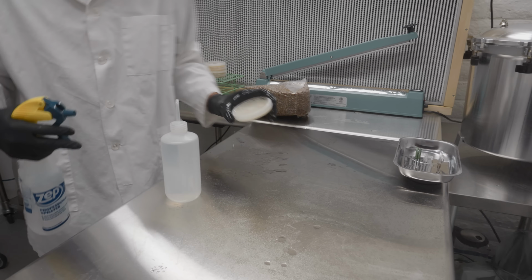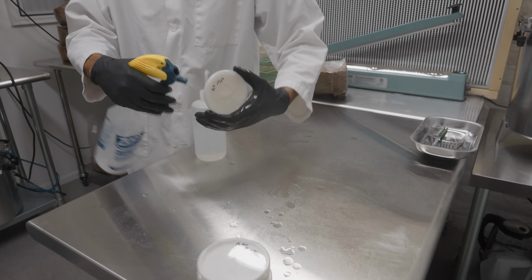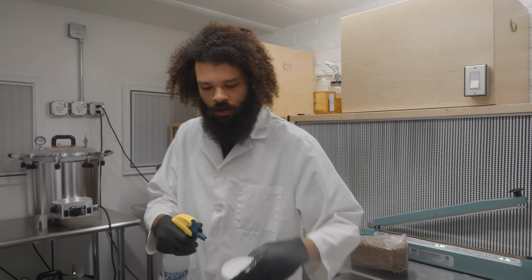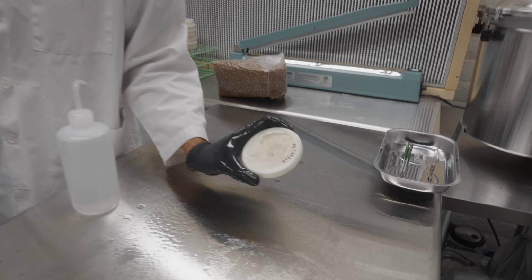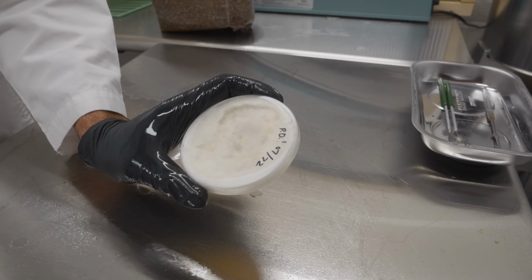So you'll notice different kinds of mycelium depending on what the species or strain is. Like the pink oyster, for instance, will develop a pink hue to it. That's our pink oyster right here. You can notice a nice little pink hue to it. Real nice cottony growth, and really aggressive.